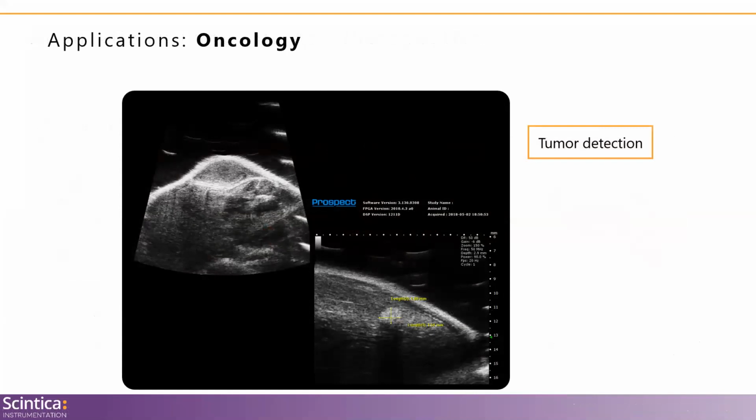In cancer biology, ultrasound is commonly used to detect tumors, and you can quantify tumor progression over time by doing things like 3D tumor volume measurements. And this can be done both for primary tumors as well as for METs, depending on where those METs are located. But as I mentioned, a common application I would say is METs of the lymph nodes.